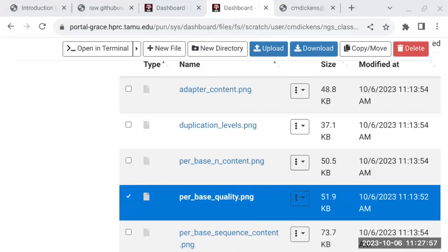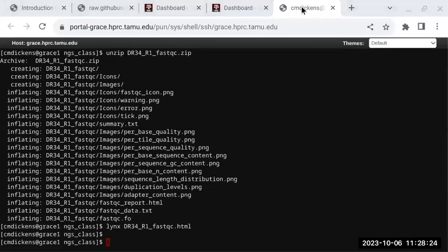75% of your data here is actually orange or above. So you can do some trimming here if you want. Some software recommends don't trim. It's part of their software package. They'll do the trimming for you. So read the instructions. GATK is one that says don't trim first. They handle that in the software. All right, here's the output.